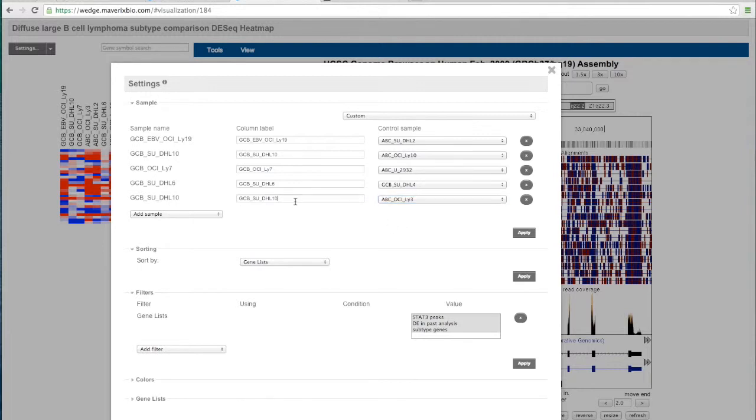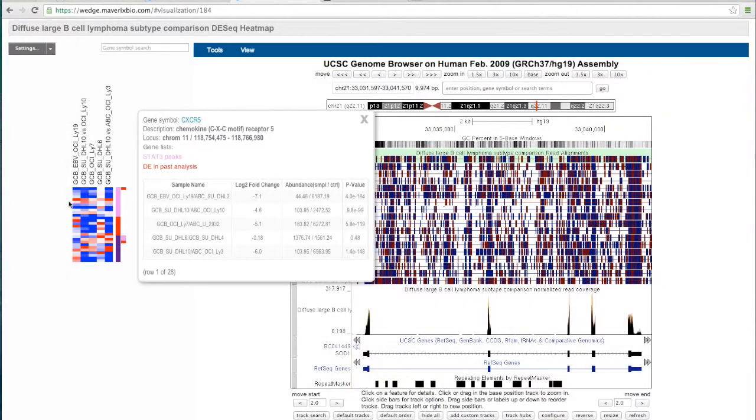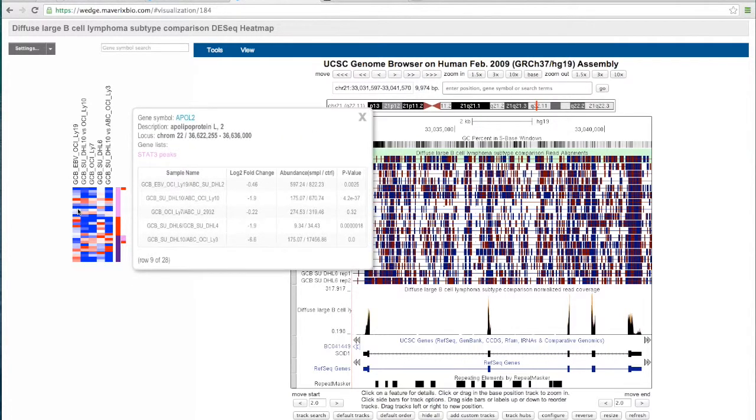And you can also change the column label names, and this is useful if you have added a sample more than once. You have the ability to change the column label so now that these can be distinguished from one another within the map. And once I've done that, if I click Apply, not only do I reduce the set of genes, columns that I'm looking at within my heat map, but I have changed the label so that it's easier for me to identify what the data set is I'm looking at.